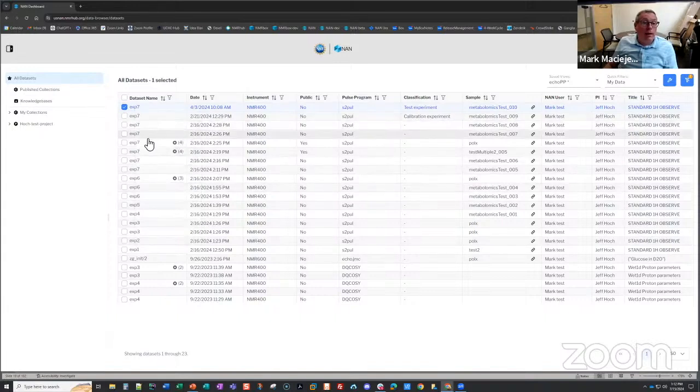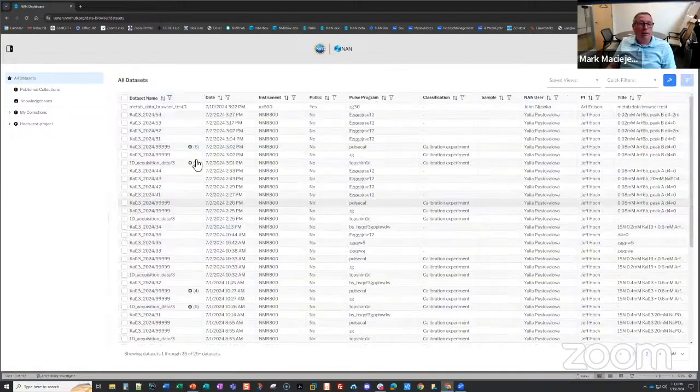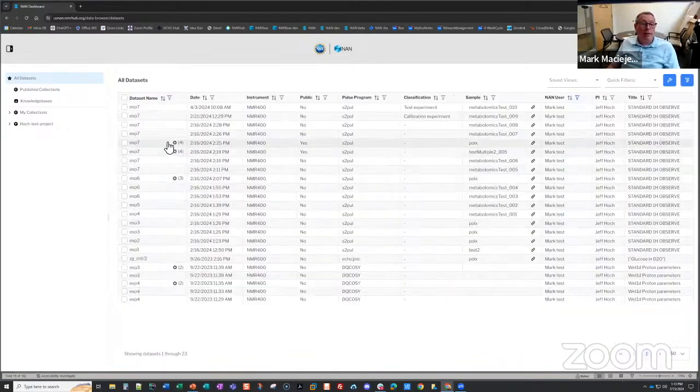So the last thing I wanted to point out here is redundancy. Sometimes we get data sets collected at the same time that have the exact same name. When that happens, we choose the most recent one to show, but we also indicate that there are 4 data sets in that collection. And the star basically means that this is the one of the 4 that it chose to be the primary. There's actually two of them in this particular case, because I must have selected two of them to be shown in testing. So you can see there's 4 data sets showing here, but I think we lost the filter. But the 2 data sets that were highlighted as non-redundant are shown.